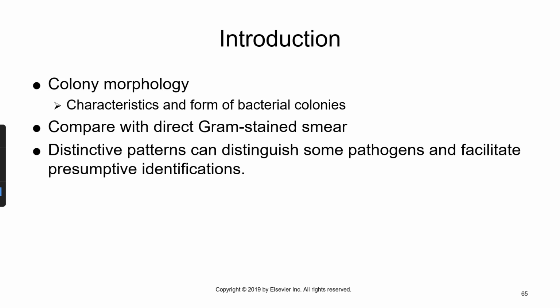But based on where that specimen came from, we're then going to determine what plates to put it on. Some labs have little cheat sheets that will say if it's this type of specimen, you put it on this, this, and this. If it's this one, you put it on this, this, and this. Other ones will actually print out what plates you're supposed to use on the label. So as soon as you scan in the specimen to the computer saying that you have received the specimen and you go to look at the orders, you can see what they've ordered, and then you can print the labels. And when it prints the labels, it'll print out on the label exactly what plate you're supposed to put it on, which makes things a lot easier, takes the guesswork out of things, and ensures that everyone is operating using the same types of protocols.